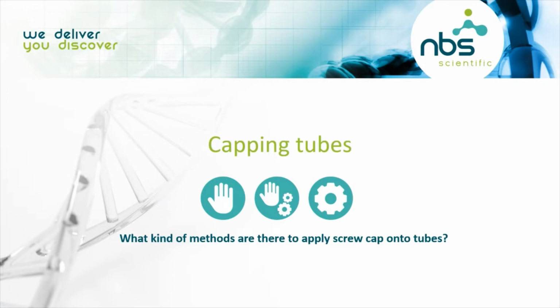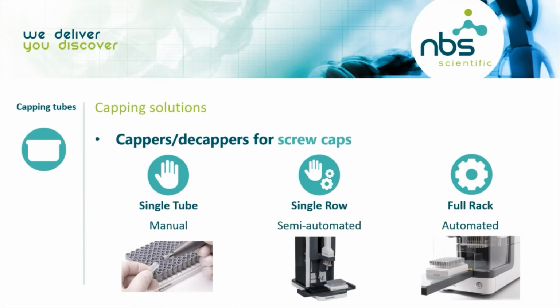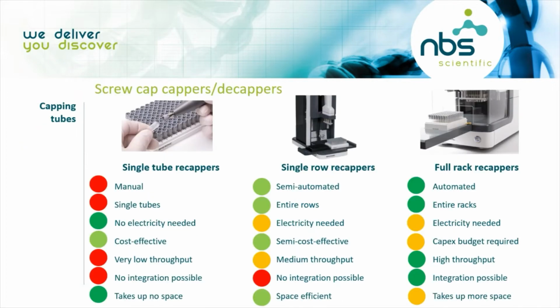We go on with the topic capping tubes. We have seen that we can cap and decap push caps, but how can we cap and decap screw caps? Tubes can be capped or decapped manually with a single recapper. You can also cap or decap an entire row of tubes with a semi-automated recapper. Or if you don't want to cap or decap a single tube or a row of tubes, but you want to decap or cap an entire rack, you can use the automated recapper. Each of these recappers has their advantages and disadvantages.